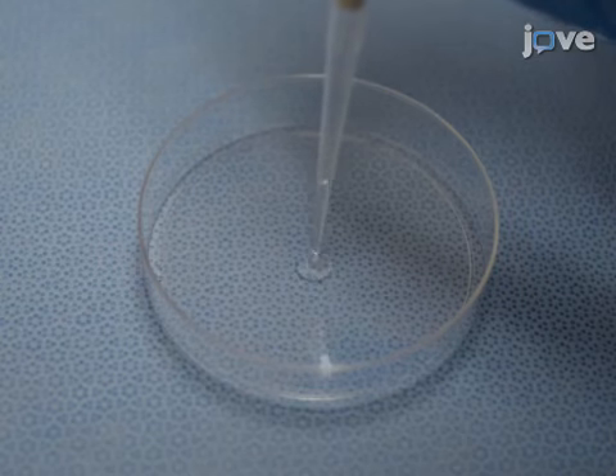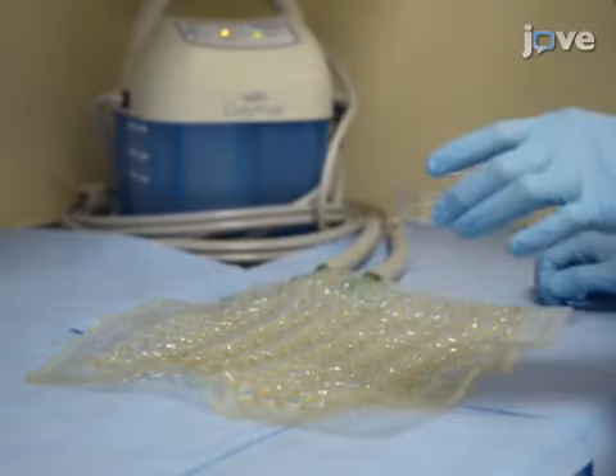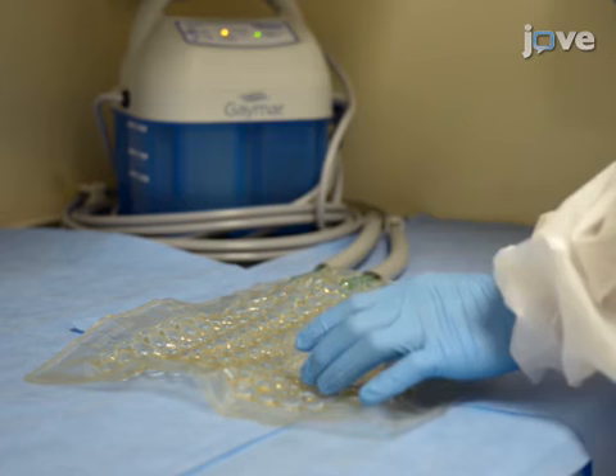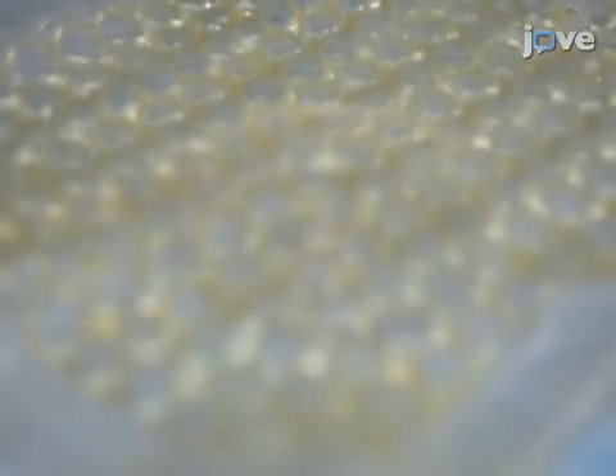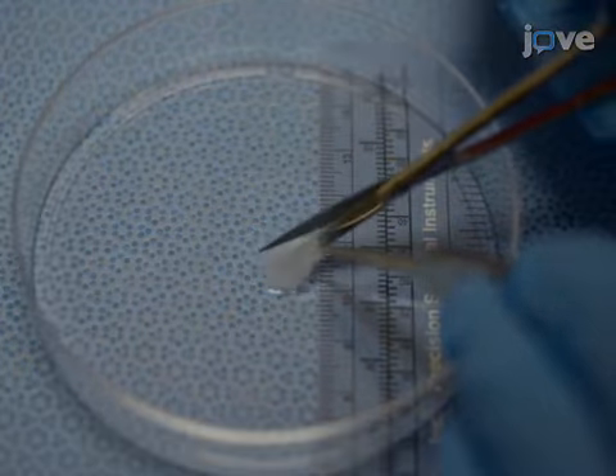Next, gently pipette 200 microliters of the mixture drop by drop onto a sterile plastic dish. Incubate the drops at 37 degrees Celsius for 30 to 60 minutes until they solidify. Then use small surgical scissors to trim the gels into approximately three by three by three millimeter pieces.